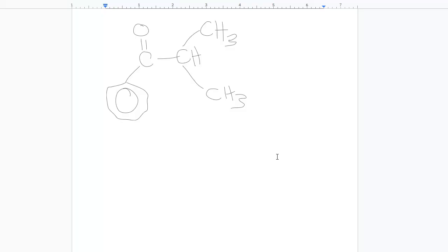then the 7 distinct carbon signals in the 13C NMR, and the proton splitting patterns and integrations in the 1H NMR. The six hydrogen doublet and the 1 hydrogen multiplet together form a (CH3)2CH group, and the 5 aromatic protons support a monosubstituted benzene.